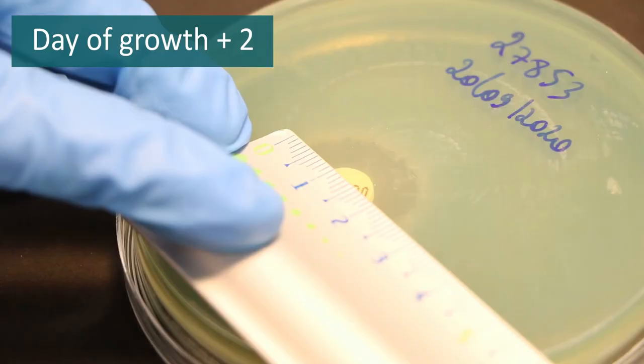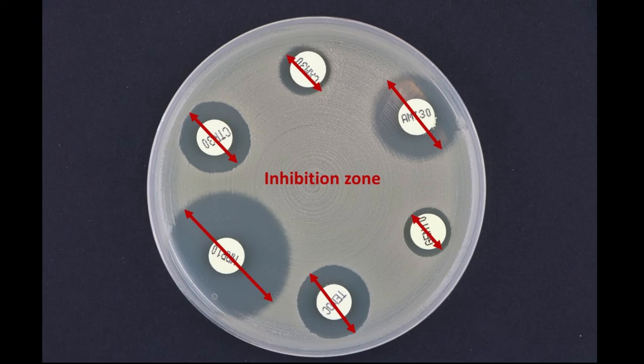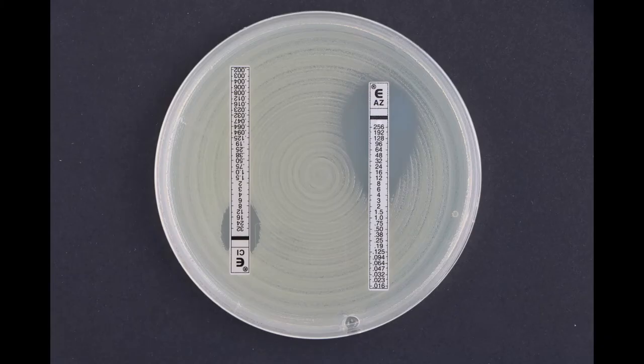After incubation, the diameter of the inhibition zone is measured. The diameter is a measure for the susceptibility of the bacterium to the antibiotic and is compared to break points in reference guidelines to define the susceptibility category.